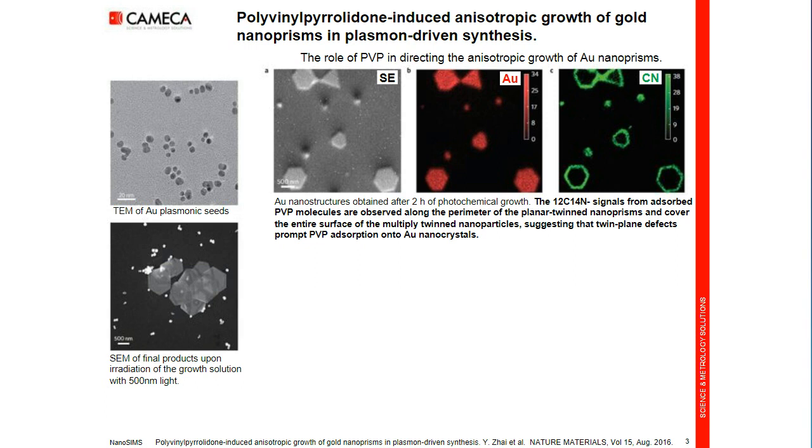So this is a very nice illustration of the NanoSIMS capability of first mapping a secondary electron, light element like nitrogen together in parallel with gold, heavy elements. So that's one thing. It shows the sensitivity of the NanoSIMS on small objects, nano objects, and also it reveals that it's very interesting to have this normal incidence and normal collection of the NanoSIMS because you have no shadowing. The collection in any direction is very homogeneous because the beam comes normal.